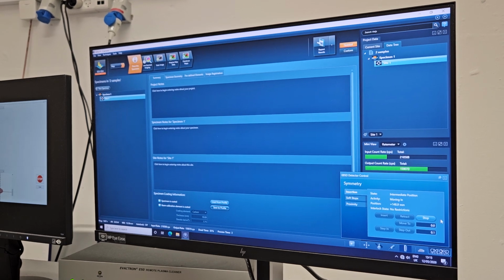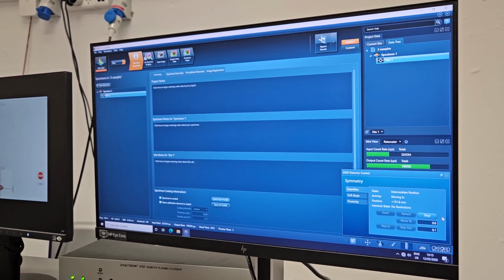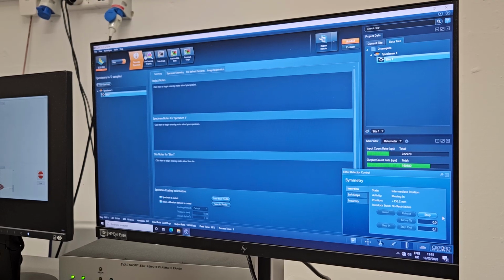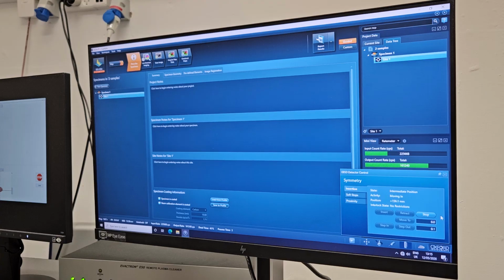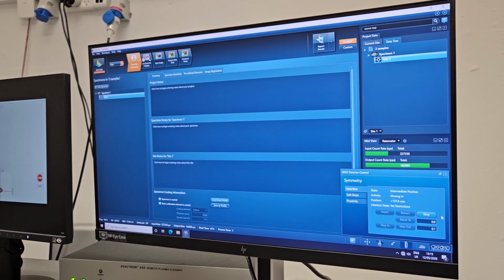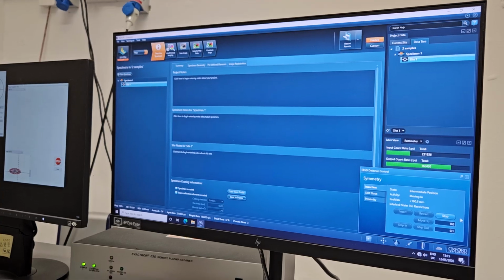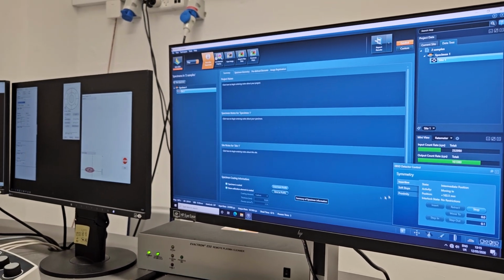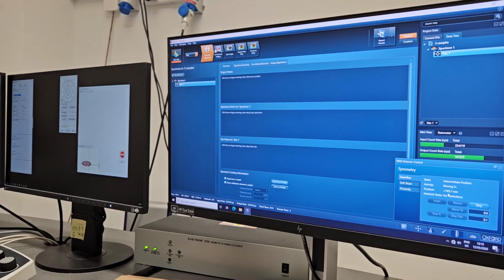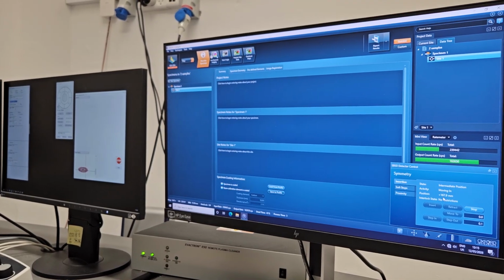So for this, there is a sensor which in theory should stop the detector when it becomes too close. Automatically? In theory, but can you trust computers? So always trust your eyes. There's still enough distance, so here you can see the position, it's 160 whatever, 7, 8.